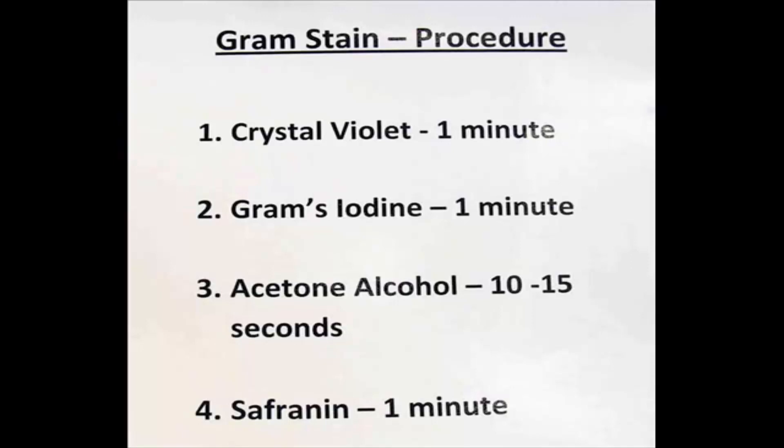My last step is to apply safranin. This is a pink stain that will stain the Gram-negative bacteria. It is my counter stain.